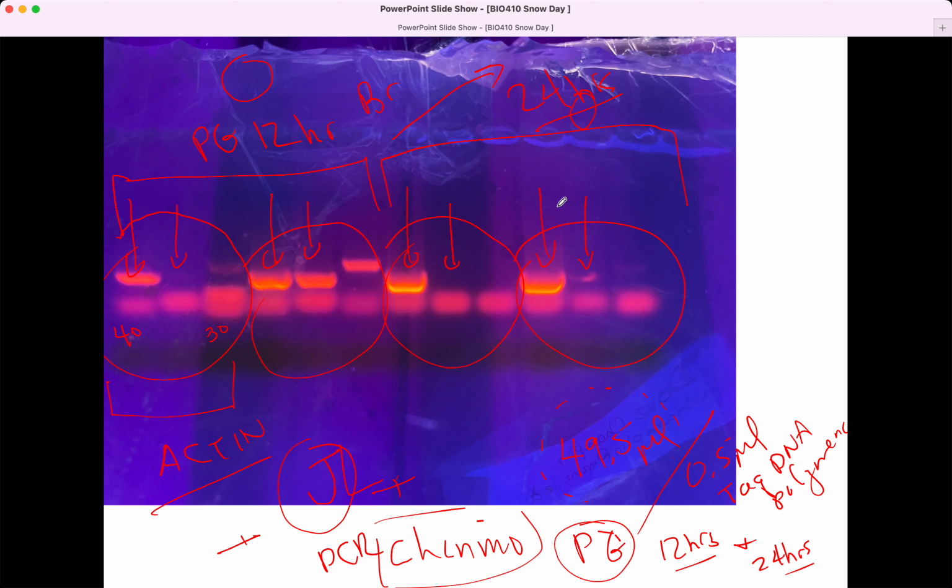I think that fits our expectations pretty well, in that I was concerned about how things got set up in the first group. This tube had the right volume, but because the other samples had kind of wrong volumes, I'm just overall concerned about this group's results. That's understandable, and we'll talk through that and ask questions.